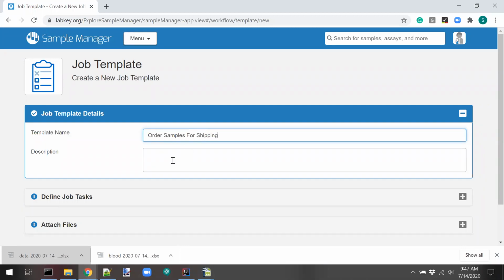I guess here, Steve, you could use the notification capability as well, right? What do you mean, Jason? I just want to make sure. You could use the notification element of. Absolutely. That's a great idea.